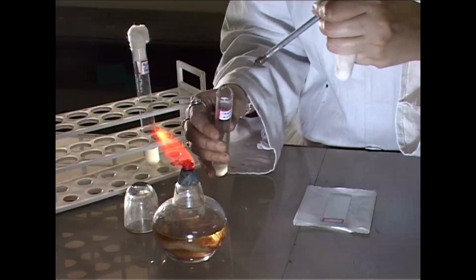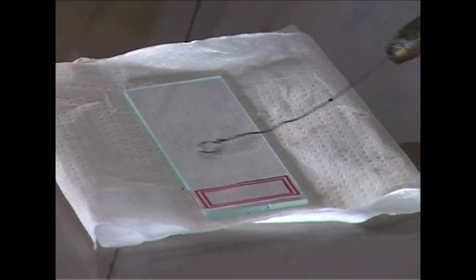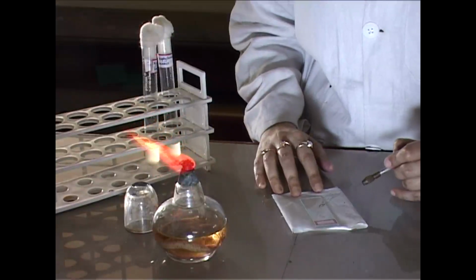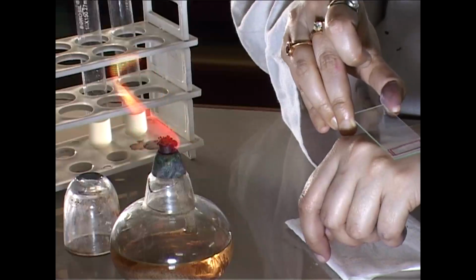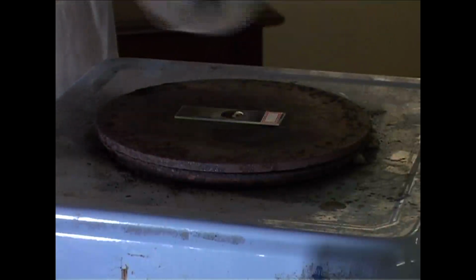We make a mixture of Mycobacterium and Staphylococcus aureus culture on a clean grease-free slide. We allow the smear to become air dry, heat fix the smear, and then flood it with carbol fuchsin on a hot plate.